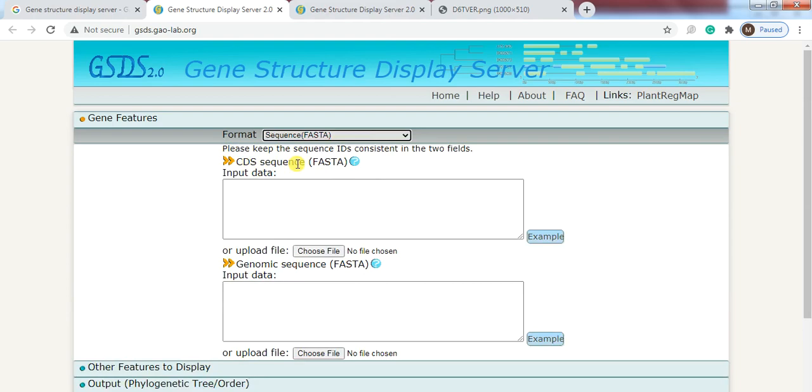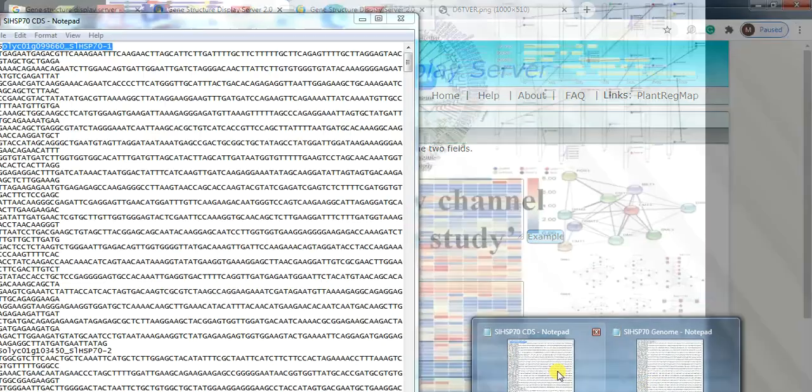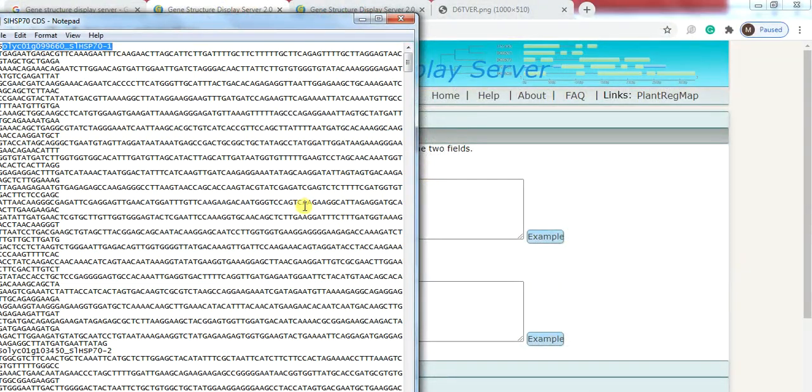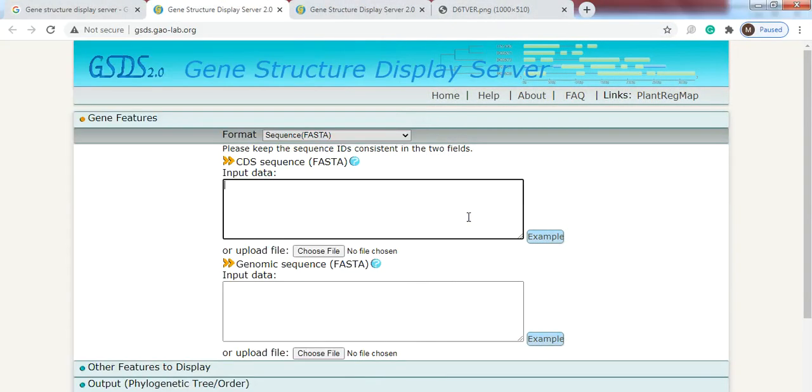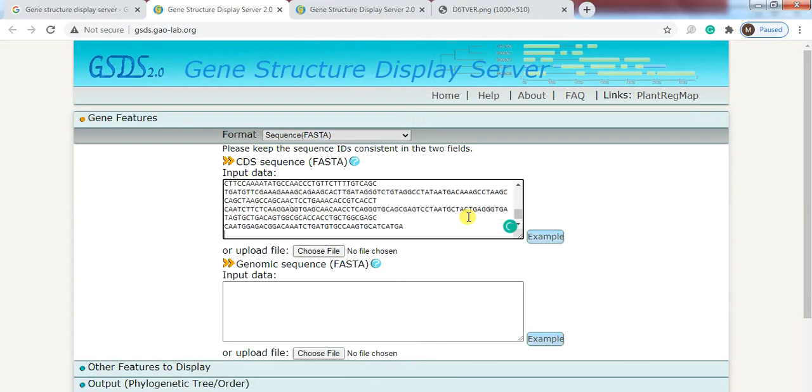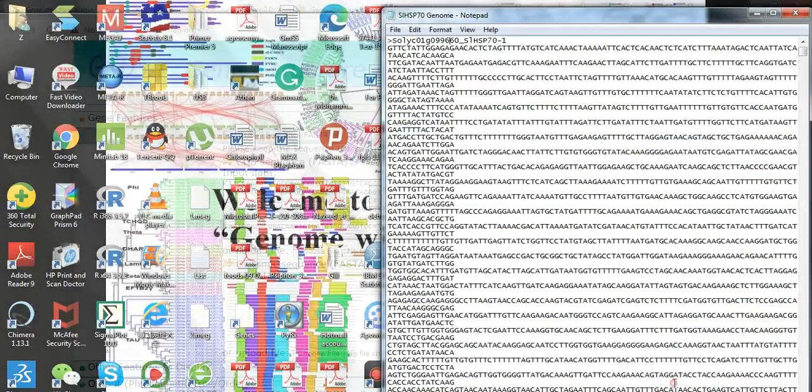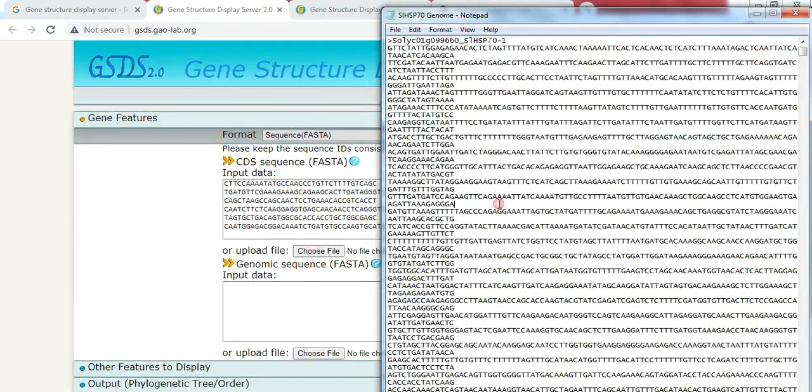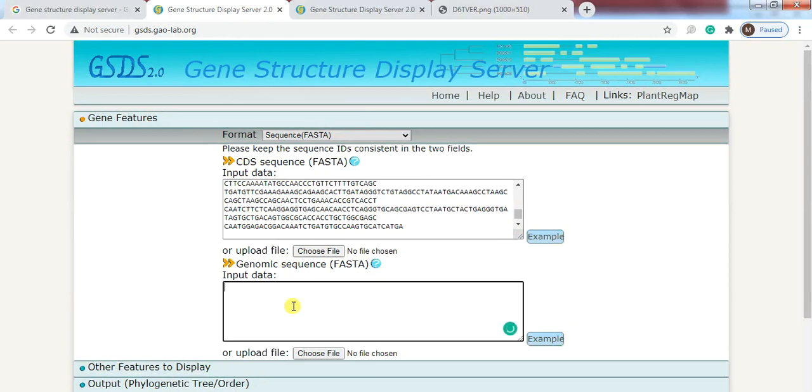Now CDS sequence input data: go to the CDS file, select all, copy, and here control V paste. Now here genomic sequence input data: so go to genomic file, control all, copy and paste.